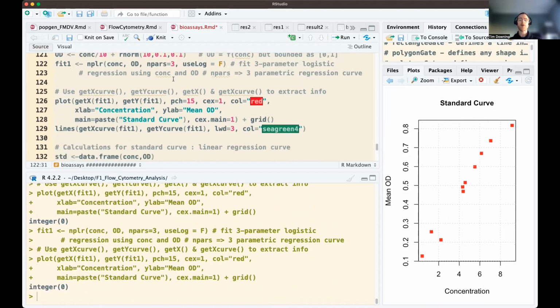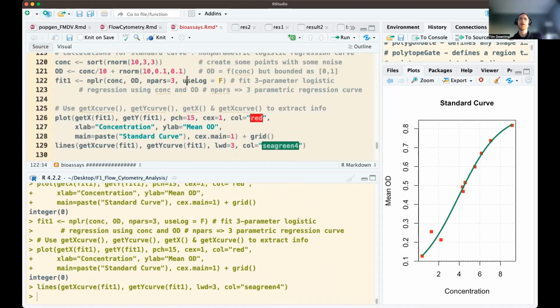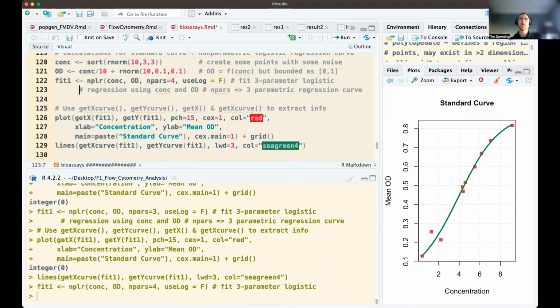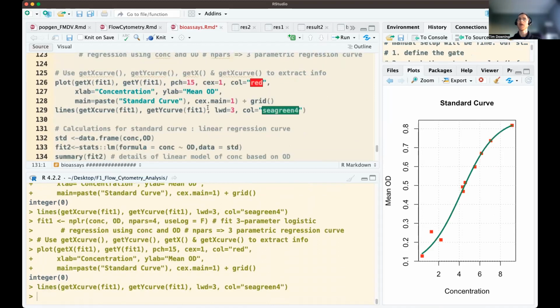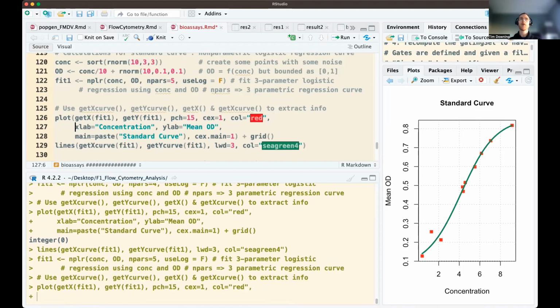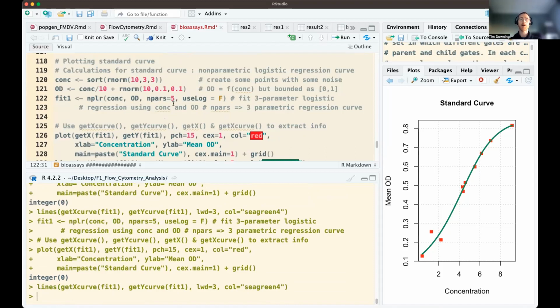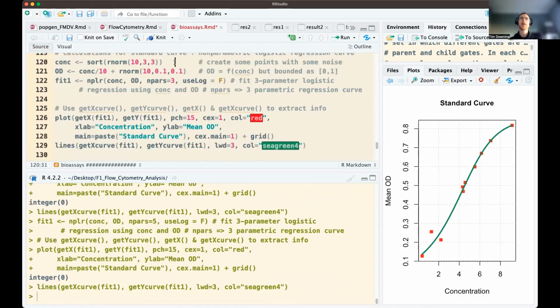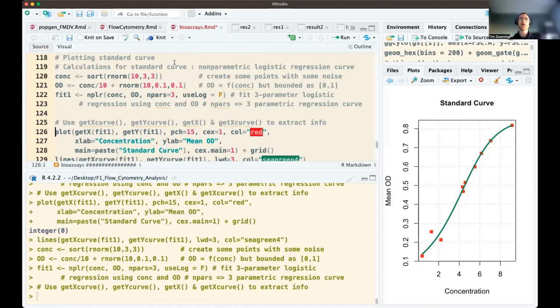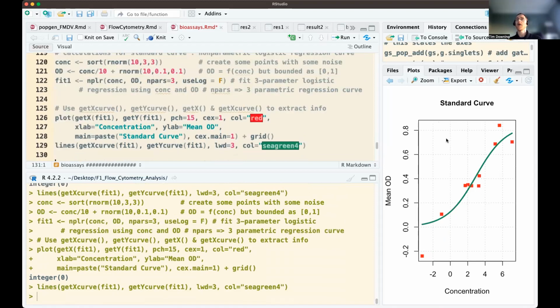If we move beyond a 3-parameter model, so let's look at the original, the getX curve, getY curve, you can see it's fitted there. If we use 4 parameters, it kind of gets over-parameterizing maybe, in terms of trying to fit the model that you have here. But you can explore that more with the NPLR function. I note that each time you run this, it will recreate different data. So you'll find that the curve is actually shaped differently, as you can see there on the right-hand side.